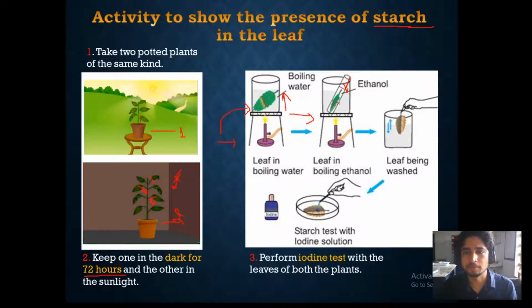In this process, the leaf which has the green color, we know leaves are green in color because they have chlorophyll. All the chlorophyll will be taken out from the leaf and enters the alcohol. When all the chlorophyll is taken away, the leaf becomes faded. The leaf becomes colorless. Just like this, the leaf is decolorized, meaning it does not have any color now.